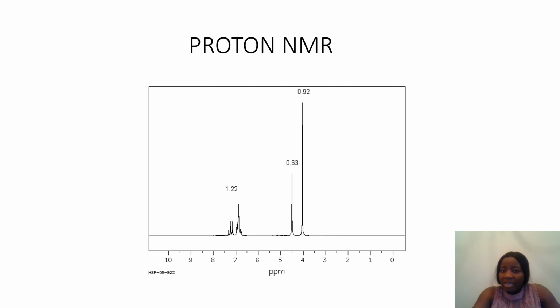Here we found out that we have 3 hydrogens, which means we have a CH3 here, and here we had 2 hydrogens, which means we have a CH2. And finally, right here, we have 4 hydrogens. And we find out that it was a benzene ring, so a C6H4.